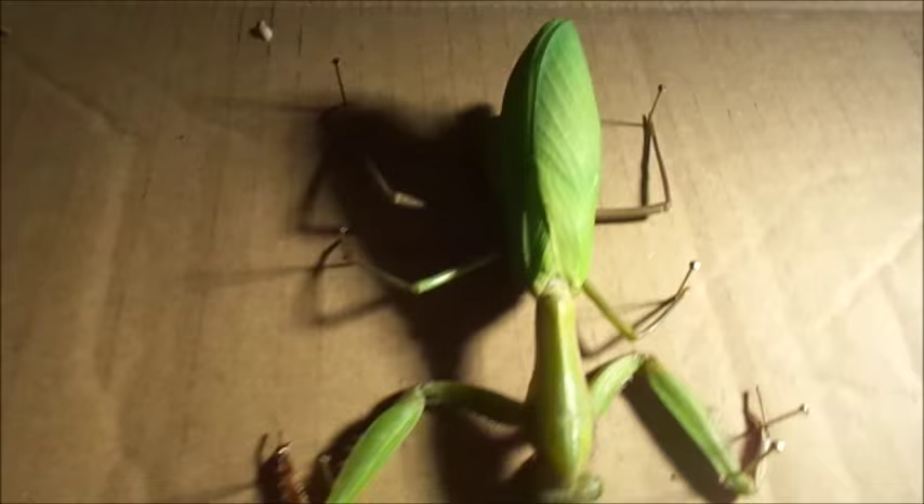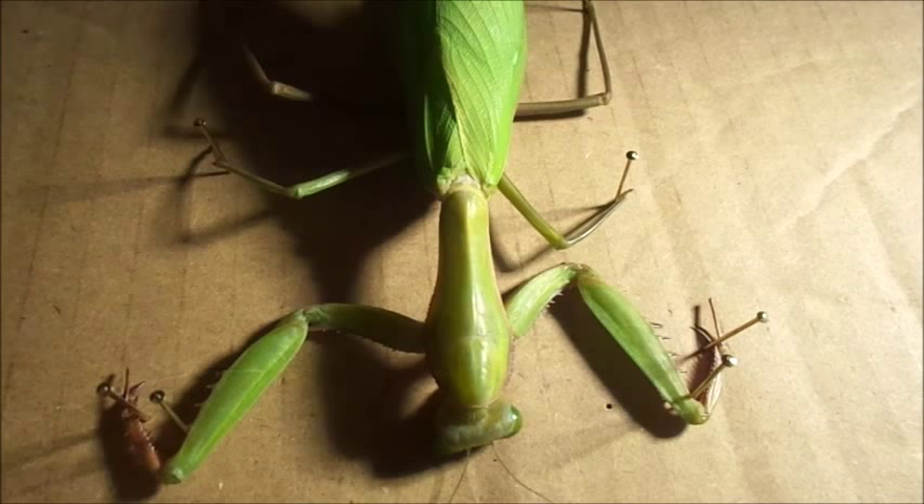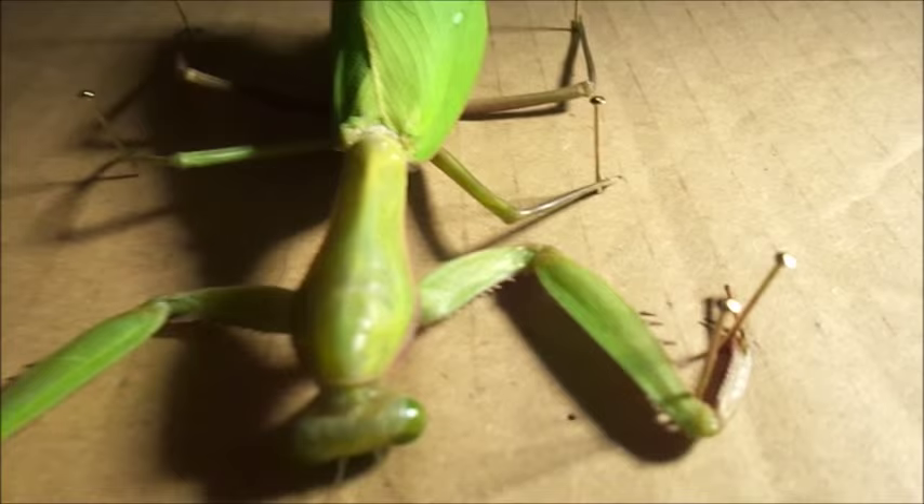This is Hestia. She is a giant Australian rainforest mantis, a Hierodula majuscula. She's been dead about two days and I'm going to dissect her.